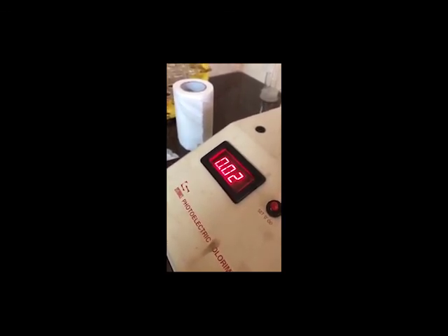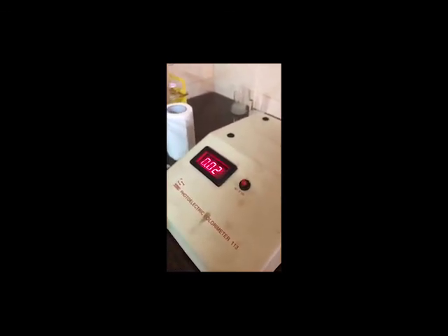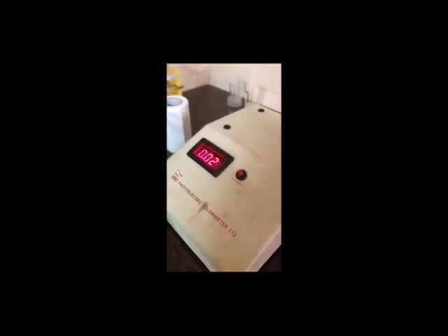From these measurements, through calculations and formula, the test sample concentration can be found out. This is all about the colorimeter and its procedure.